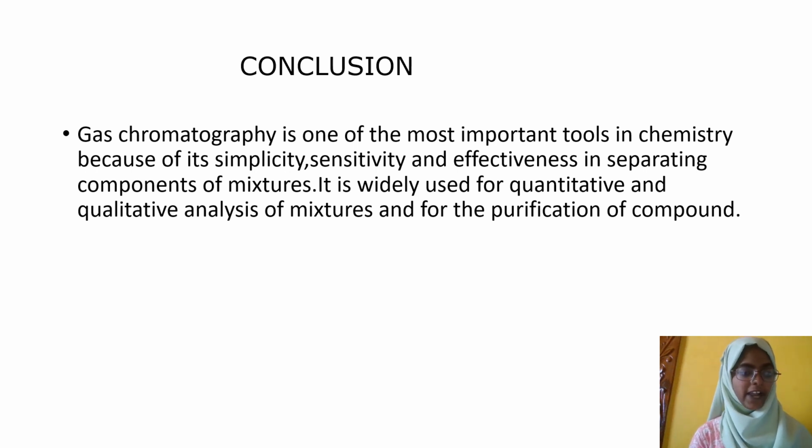Conclusion. Finally, I conclude that gas chromatography is one of the most important tools in chemistry because of its simplicity, sensitivity, and effectiveness in separating components of mixtures. It is widely used for quantitative and qualitative analysis of mixtures and for the purification of compounds.